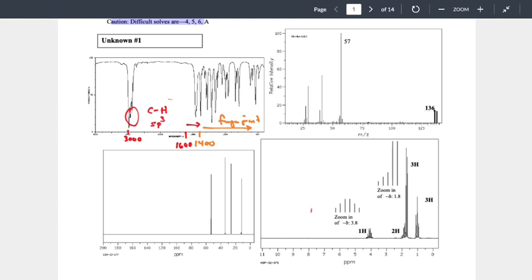Okay, so what does that mean for us? That means we have the molecular weight for our compound. So when this compound was run through the mass spec, we discovered that it has a mass of 136 grams per mole. Right? And now what we're going to encounter is kind of the next stage behind what's going on with mass spec. What is mass spec all about? Right? It is trying to find the mass of the particle.